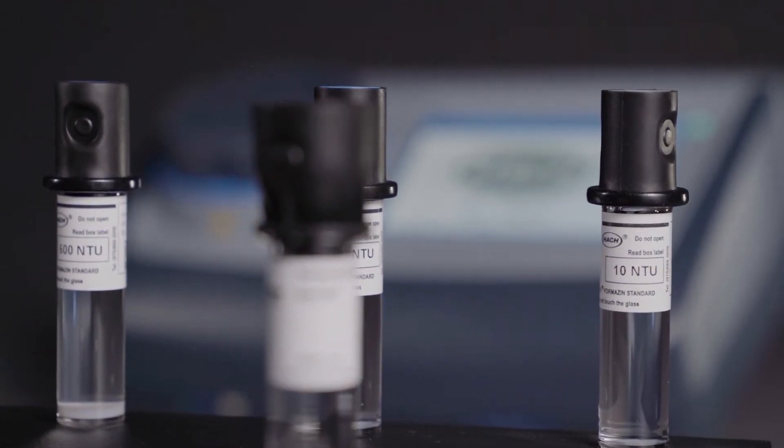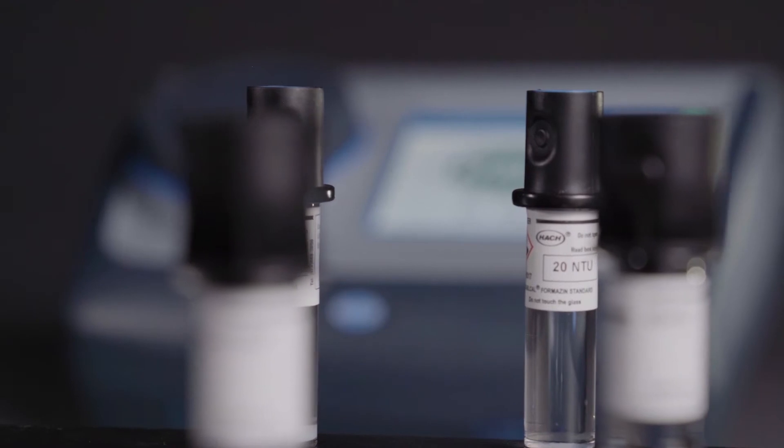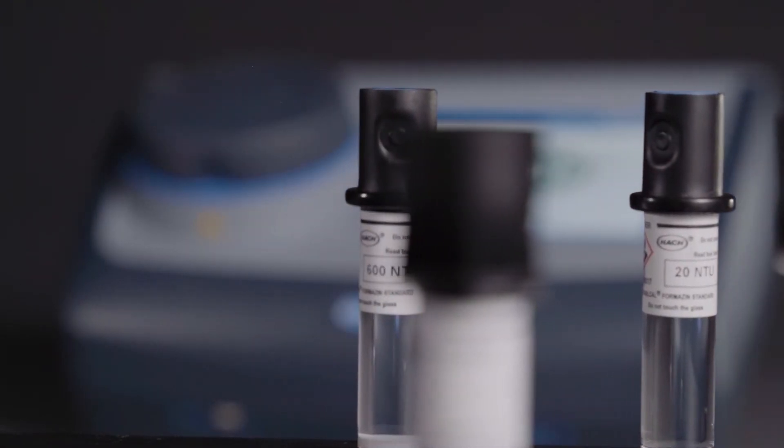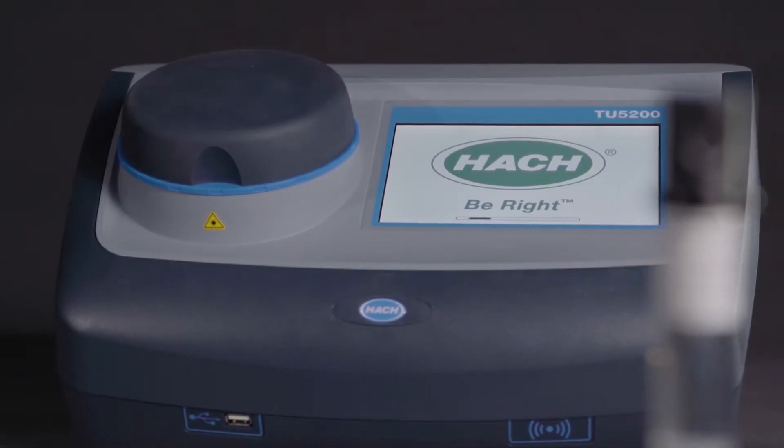TU5 is faster. It's faster to respond to changes in turbidity because of the lower volume of the sample. It's faster for you to calibrate and to clean. It's faster for you to bring confidence in the results that you're producing.